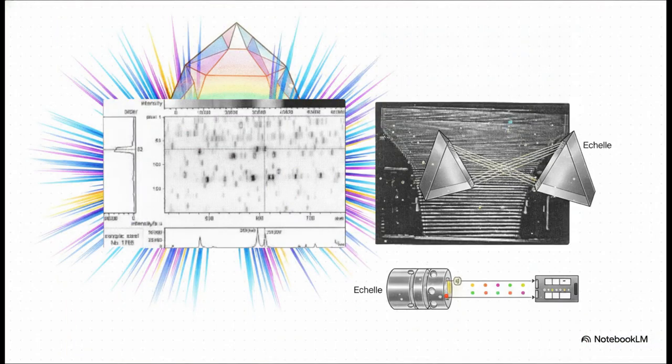To really appreciate this mass filtering approach, it's helpful to briefly contrast it with an older cousin, ICP optical emission spectroscopy, or OES. OES relies on light, often using echelle optics. Now, an echelle uses physical cross-disperser prisms to separate light into a two-dimensional spectrum. But echelle optical systems suffer from order overlap, where resolution degrades at the edges of wavelengths, causing stray light and background noise. By physically counting mass instead of sorting light, ICP-MS avoids these optical aberrations entirely, granting us vastly superior sensitivity.